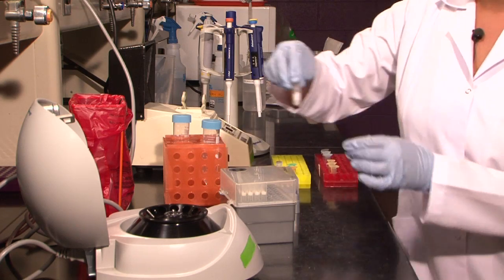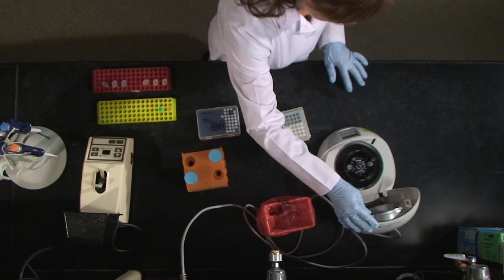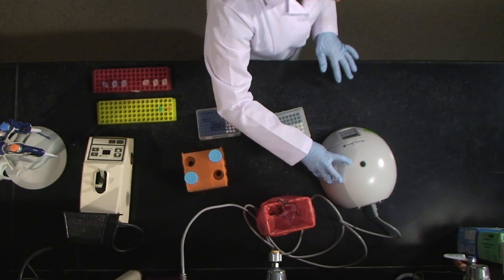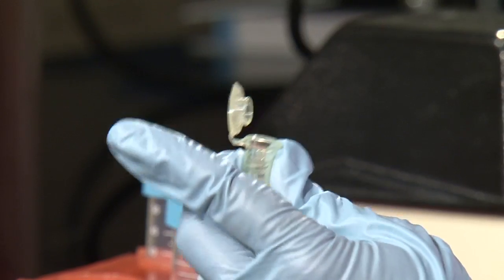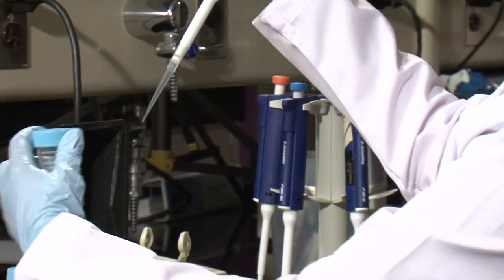In order to maintain experimental control, blank filters without DNA are also extracted, along with known amounts of salmon DNA for reference. This ensures the results have not been contaminated during the process.